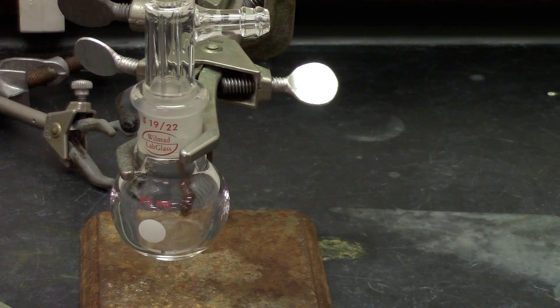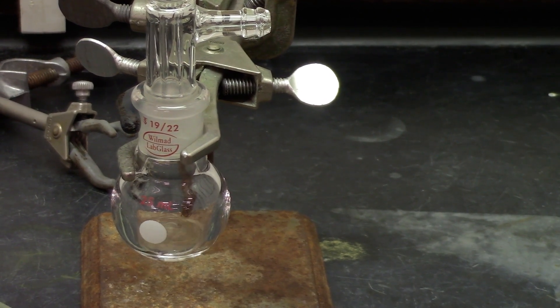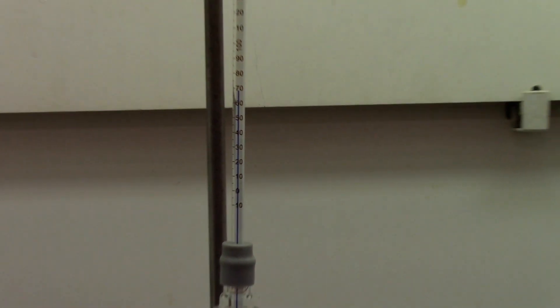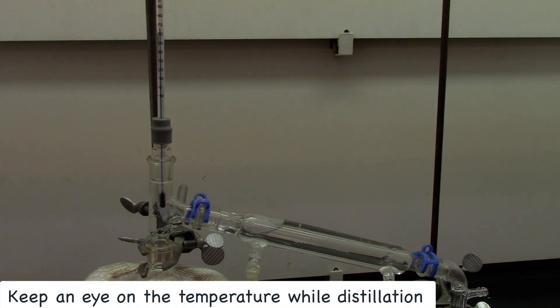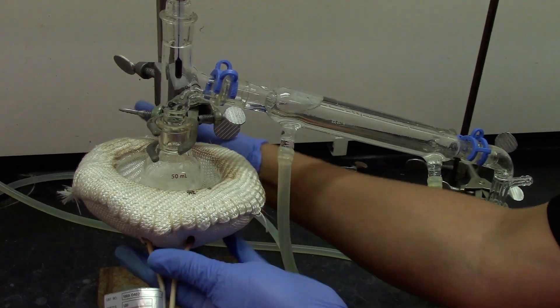As you can see, the mixture has started boiling and we have started collecting in the collection flask. Right now the temperature is around 70 degrees Celsius, which is the boiling point of hexane, which is the more volatile component. Once the temperature goes past 80 degrees, we're going to turn off the heating and lower the mantle.